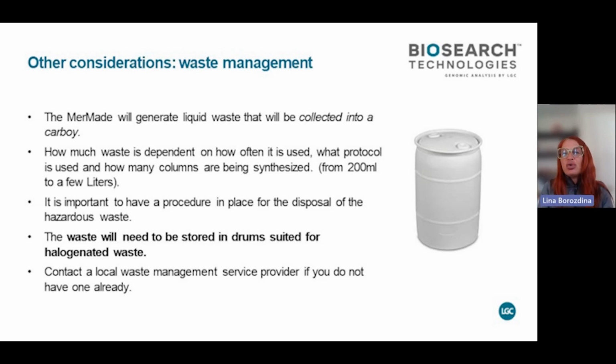So you want to make sure that you have that account set up before you start generating the waste from the instrumentation, because you have a full bucket of waste, and what do you do with it? They usually bring you disposable drums, and you dump your waste into them, and then Safe Harbor comes in and takes them away to disintegrate.